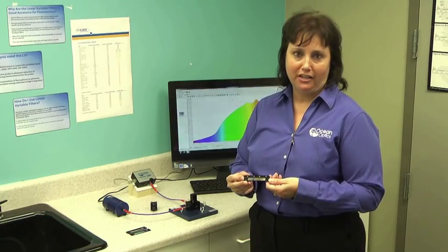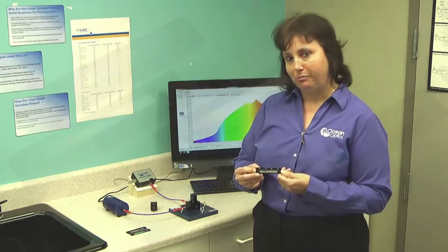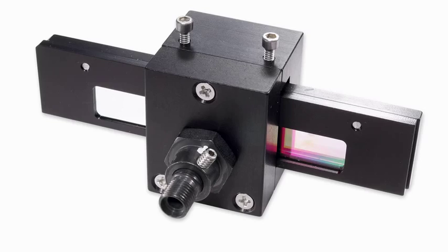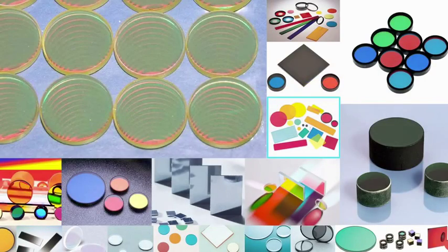The linear variable filter set is a great addition to your laboratory whenever you're making fluorescence measurements. This combination of linear variable high pass and linear variable low pass can replace a drawer full of band pass filters in your laboratory.